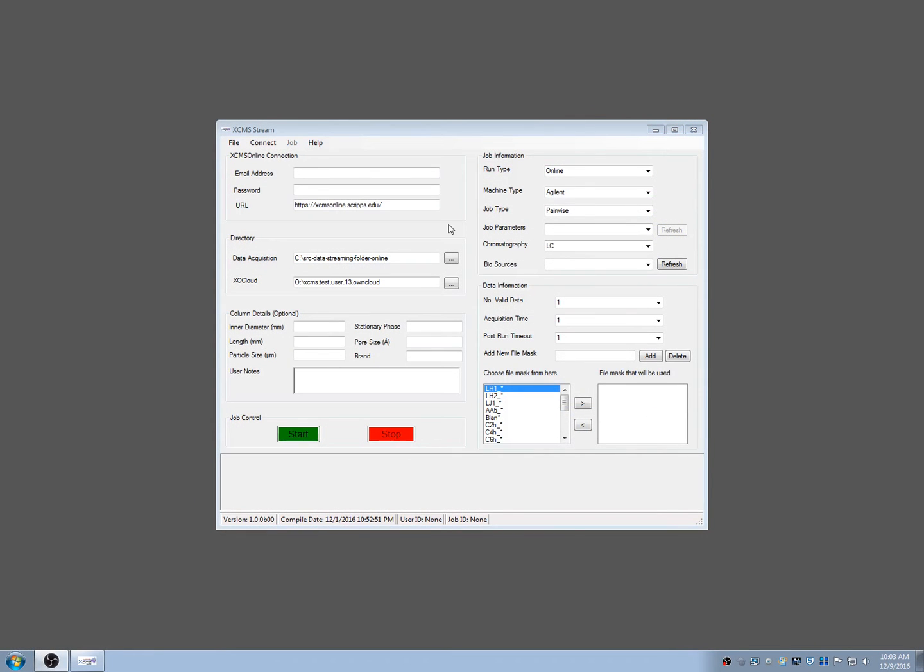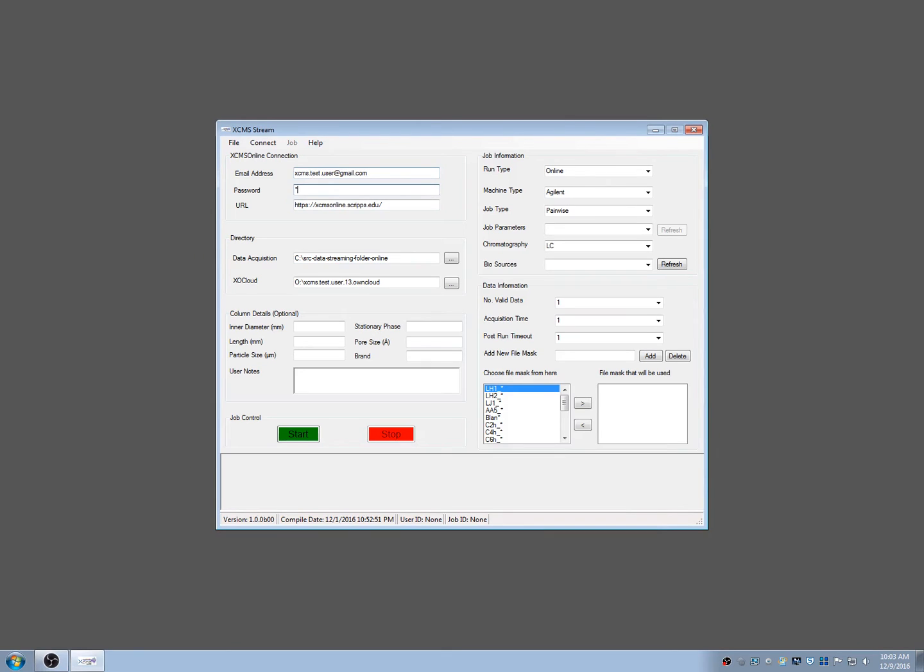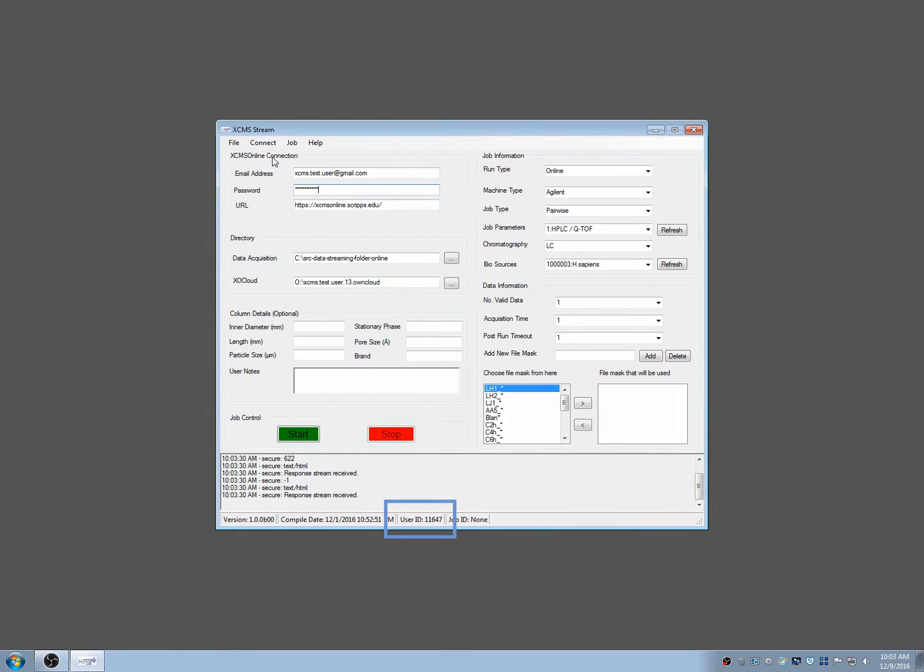XCMS Stream's graphical interface is broken into sections. Everything you need to submit a successful job is represented by these fields. Let's start by entering your XCMS Online email and password. Click Connect from the menu bar and choose Login. Your user ID will appear in the status bar below.